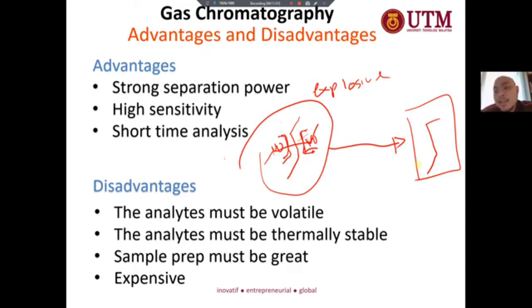You can still analyze, you know that. You inject this, it will appear as this, but it's not stable. When it's not stable, you deal with reproducibility and repeatability. I hope you guys find out about reproducibility and repeatability. I will try to ask in the class later on what you understand by reproducibility and repeatability. So the problem is with the reproducibility and repeatability.